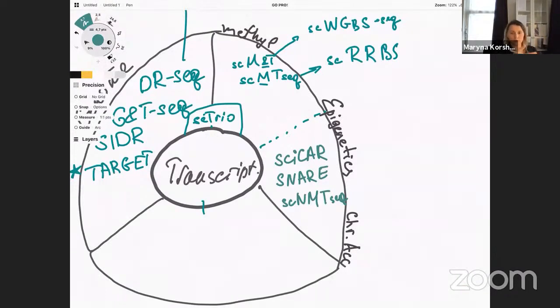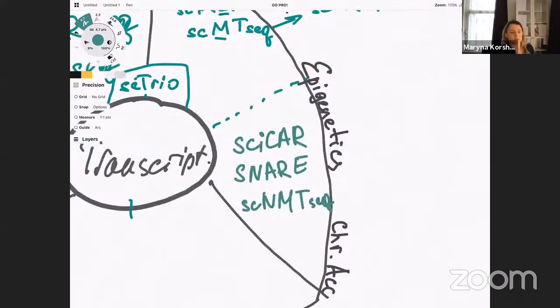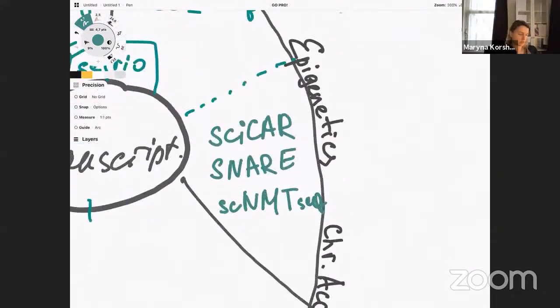So what do you do there? First of all, you apply a microfluidics approach for cell isolation, and then do open chromatin tagmentation using transposase Tn5, followed by dual omics capture. So you do this profiling of open chromatin regions and single cell transcriptomic studies.